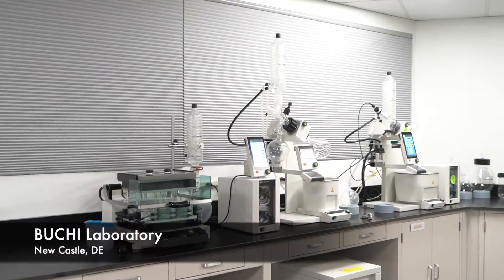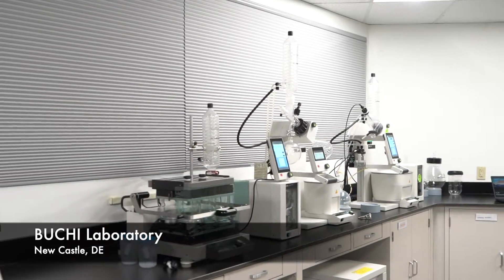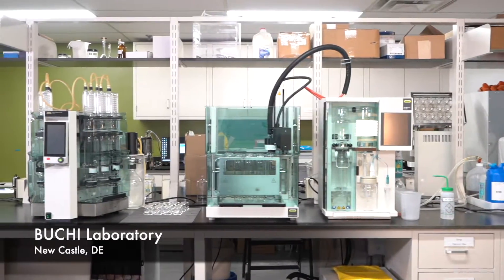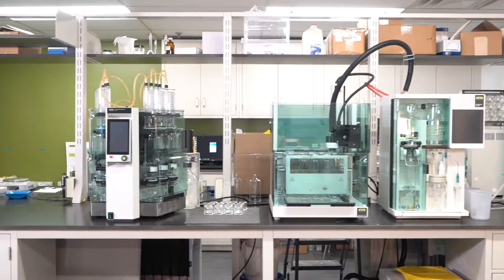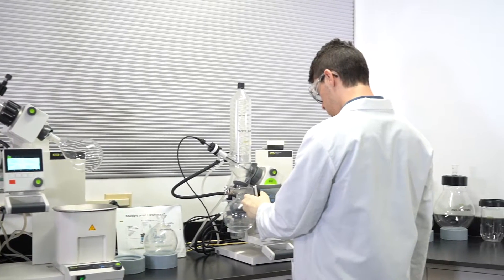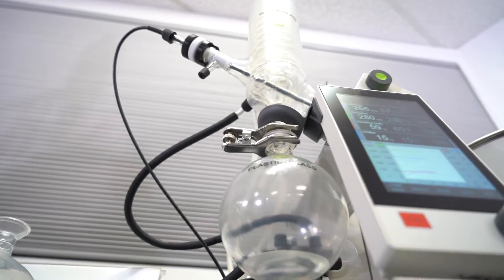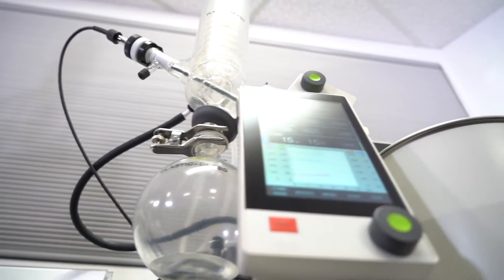Buki's demonstration lab here in our main office is used to showcase instruments and conduct feasibility studies on customer samples. If you've been talking to the customer about a Buki product for a few weeks, but the customer needs just a little more information, scheduling a virtual demo connects the customer directly with a product specialist, like me, who can walk through instrument features, operation, and other questions that may arise.